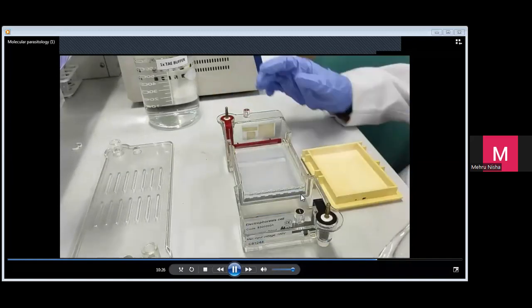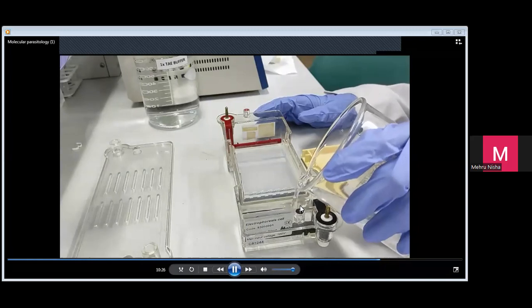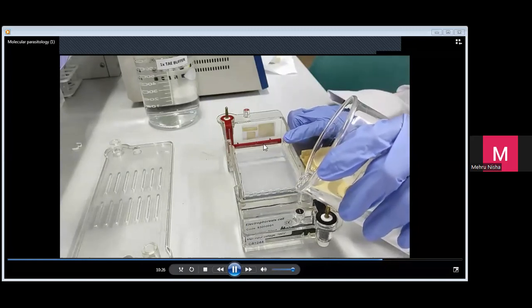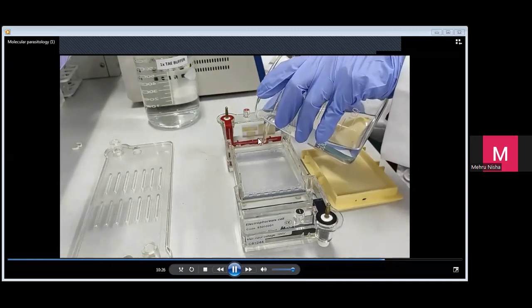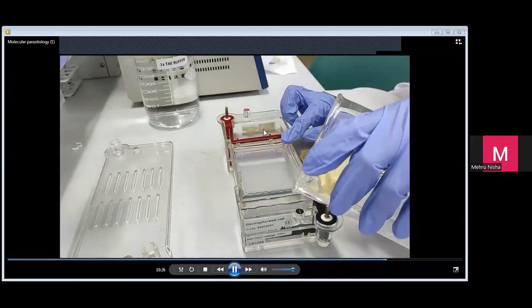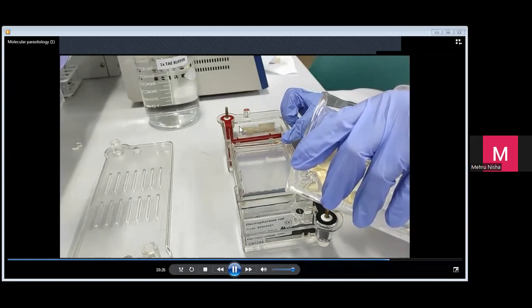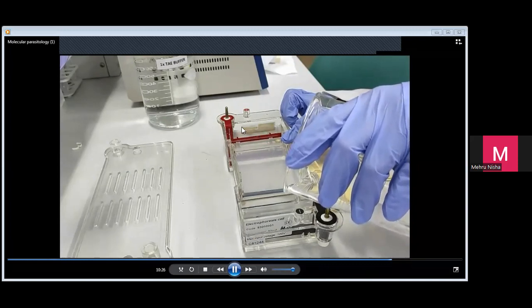Okay. So next we have to transfer it into our electrophoresis gel. So for this we have to fill the tank. Isi tank ni sampai dia punya buffer melintas dia punya agar. If not the current won't flow. So you have to make sure it's sinking lah. The gel should be sinking into the buffer.